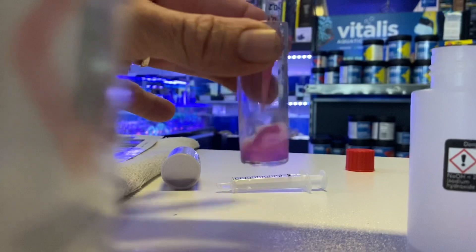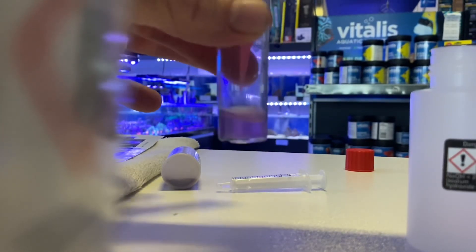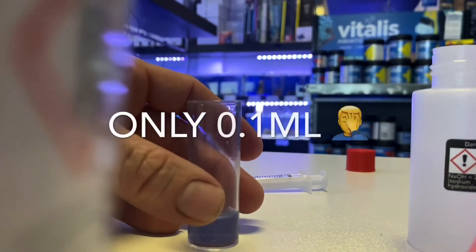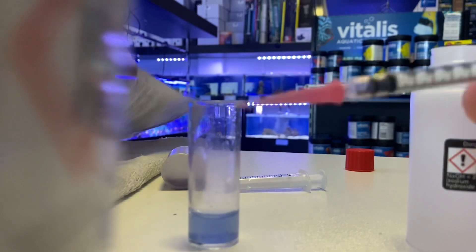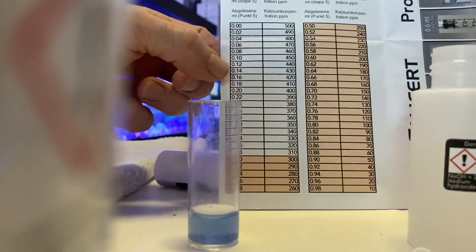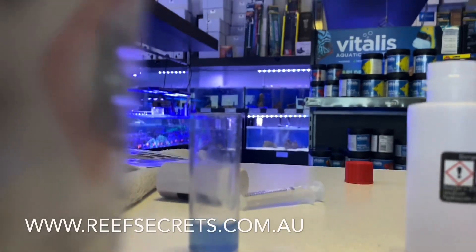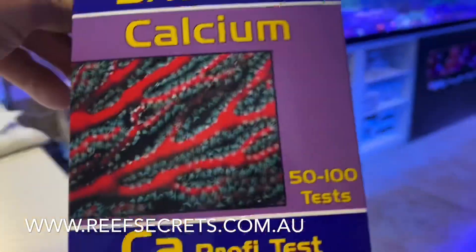Now you very slowly add it drop by drop until it changes to blue. As you can see, it's gone blue. I look at what's left and there's exactly one mil left on the dot. If you go to your chart and look at one mil, my calcium is exactly 450.